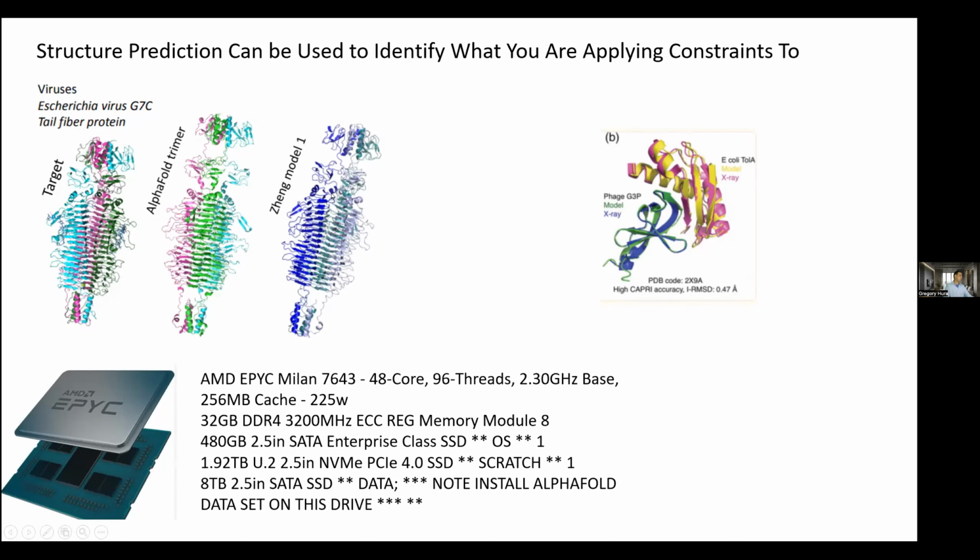Another academic group... So if you have the radius of gyration and the cross-section and volume, etc., you can take something that comes out of AlphaFold and compare that to what you've measured in SAXS and make corrections, right? That makes sense. And then, this is the level of prediction. So especially with AlphaFold multimer, this is ab initio. But right now, AlphaFold multimer has been demonstrated successfully just for these small kinds of connections.